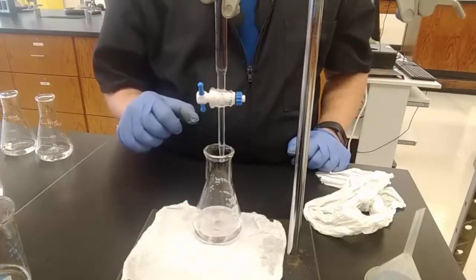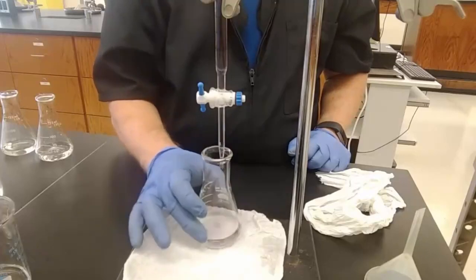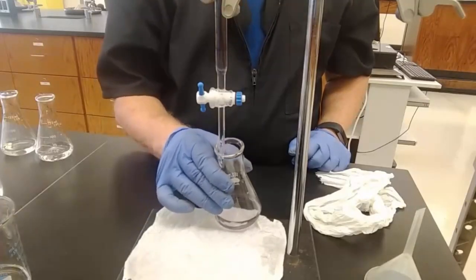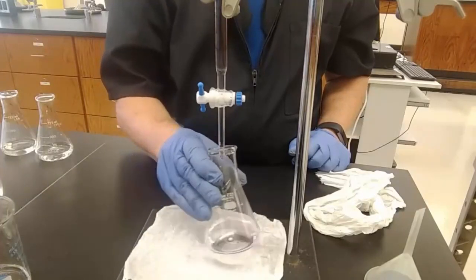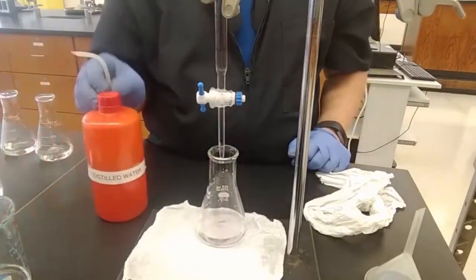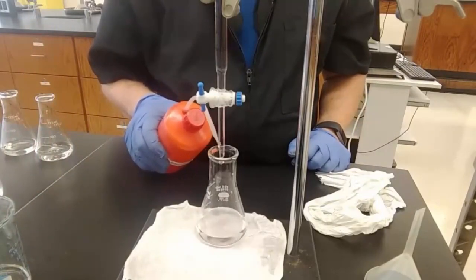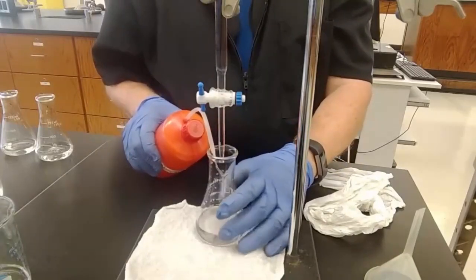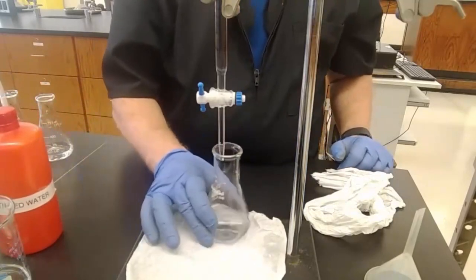Again, I don't know how much this is going to take. Patience. See, it turned pink up here. There's a drip up there that's very, very pink. Because up there, all the acid has reacted with all the base. But I'm just going to drip it down the sides as I go. It can do this also with deionized water, hitting the burette as it drips, also rinsing down my sides as it goes. Again, the amount of water doesn't matter because the amount of H pluses from the vinegar is already in there.